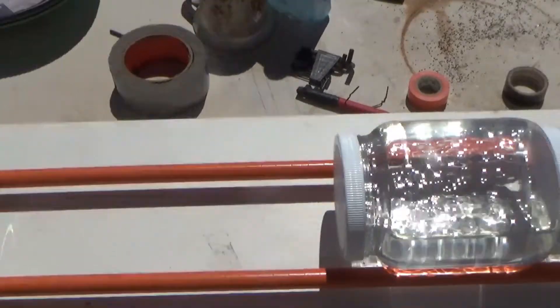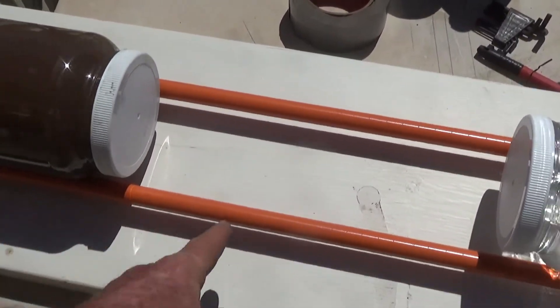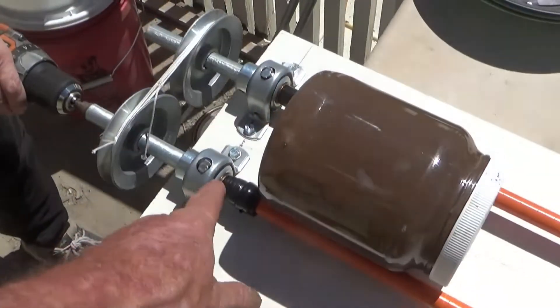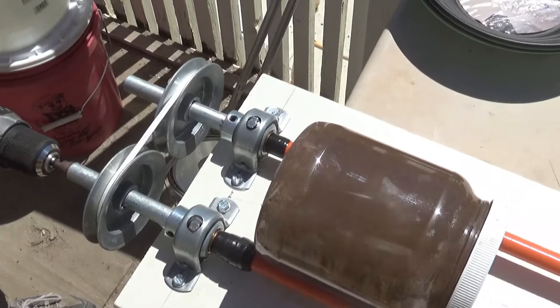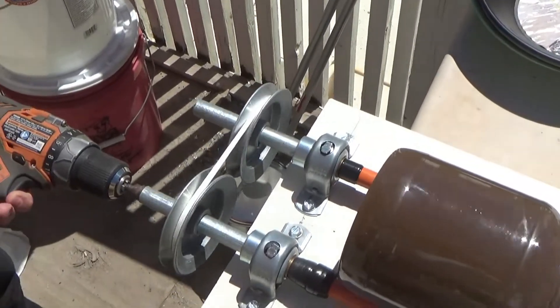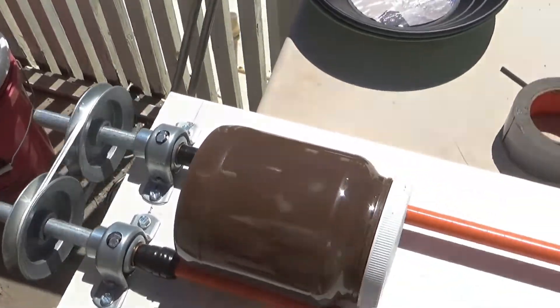These are just pieces of half-inch conduit wrapped with electrical tape, a cooler motor — push in on it and that will grip it — and a couple of pulleys to drive both of them.